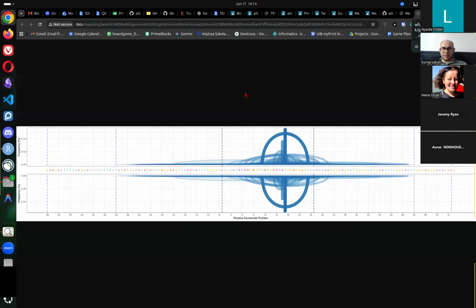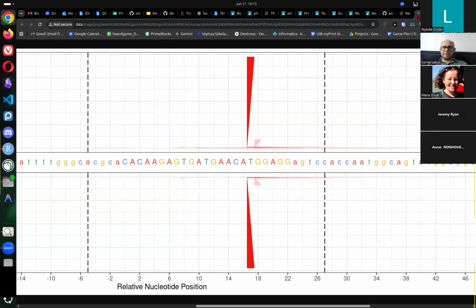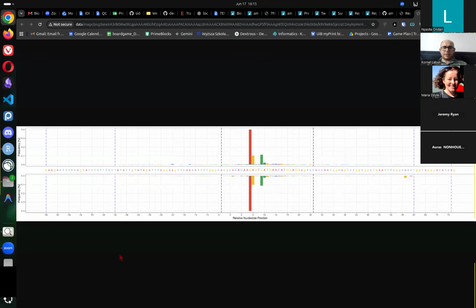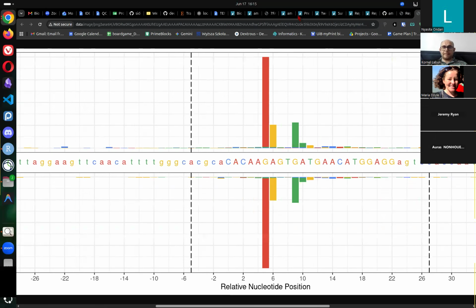These are insertions. So insertions over here you can see. And mismatches. And it matters at which frequency they occur. So you can see in our case, this is the patient who has almost 50% of this G to A transformation. So yeah, because this is some real data.